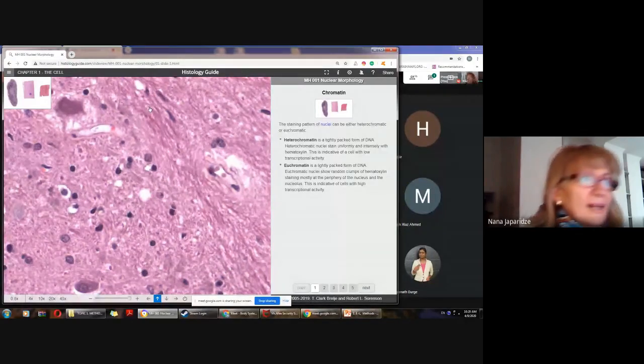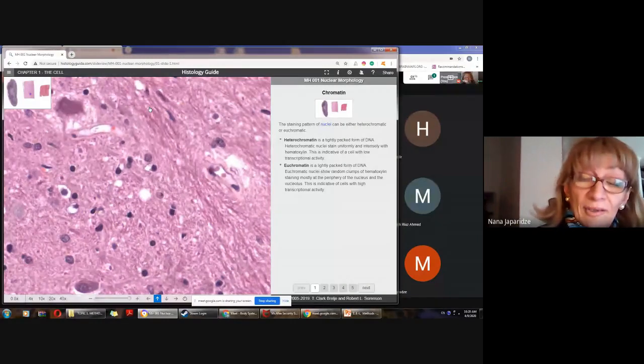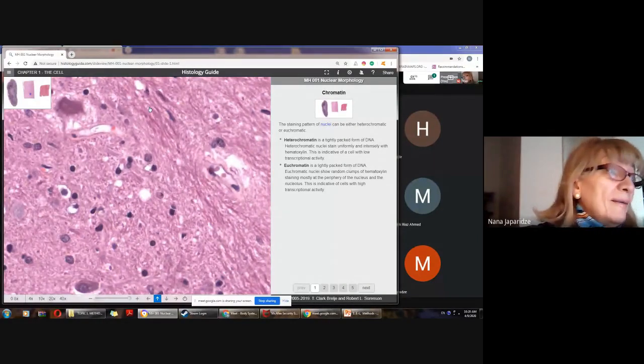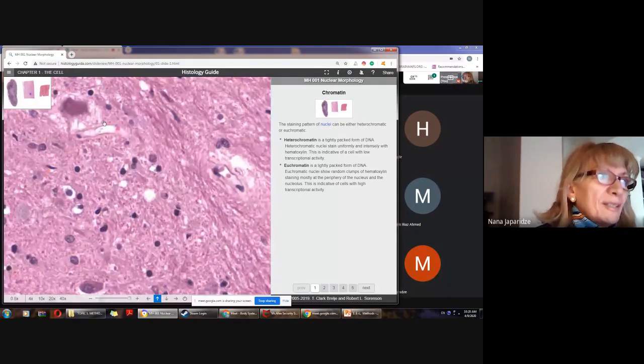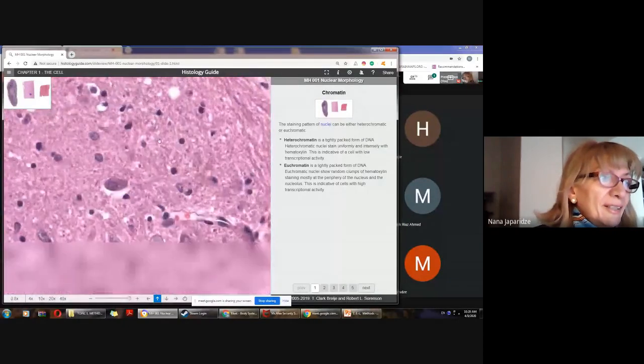So these are structures which actually are derived from the cells themselves, because neurons have a lot of processes, axons, dendrites, and via these axons, dendrites, they are intensively interconnected in the nerve tissue.